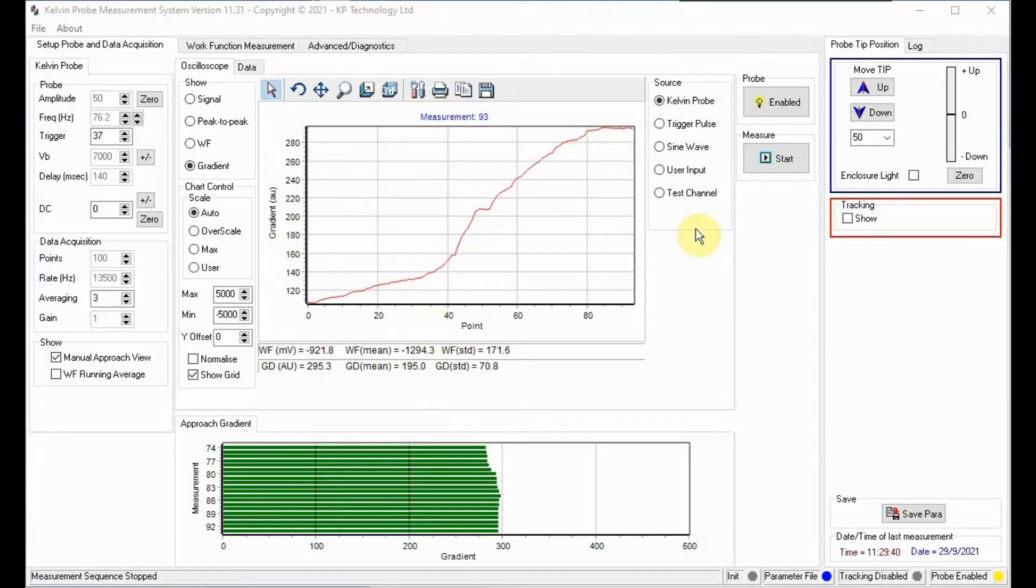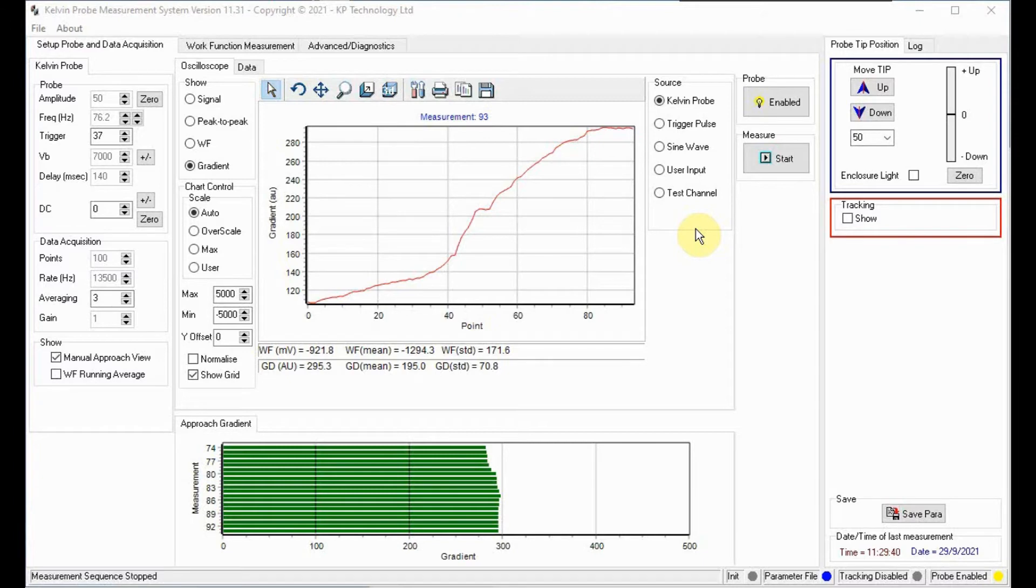At this point we remove the anti-static wrist strap and can now close the enclosure door. Now we are at gradient 300 we can stop measuring and increase the averaging to 30.